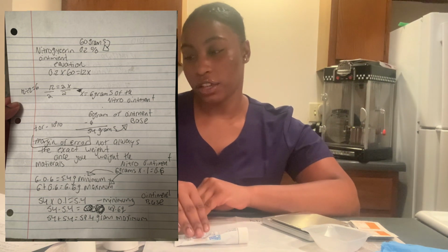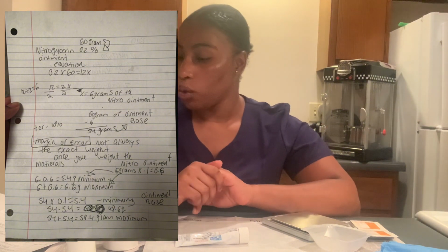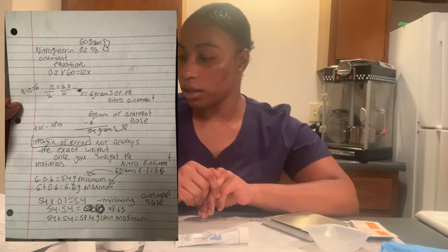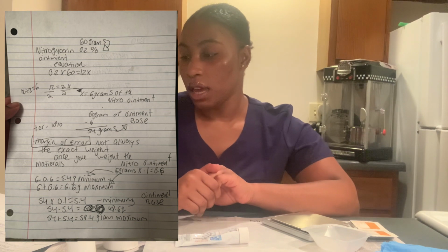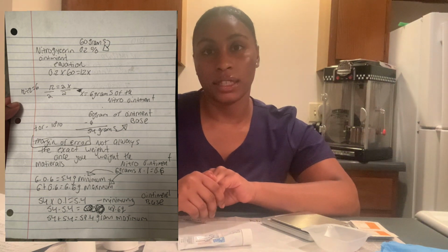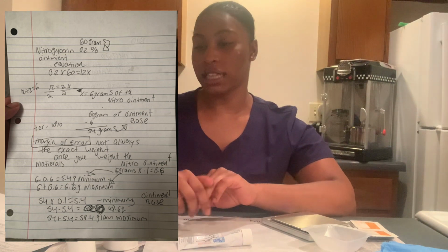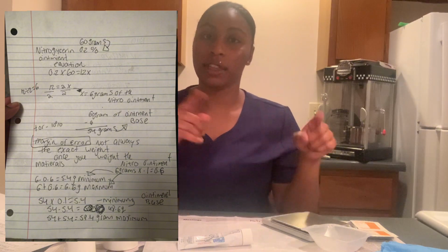With that calculation, we'll take 12 and divide it by 2, which equals 6 grams of the nitroglycerin ointment. That's exactly what we're going to need to weigh on this.